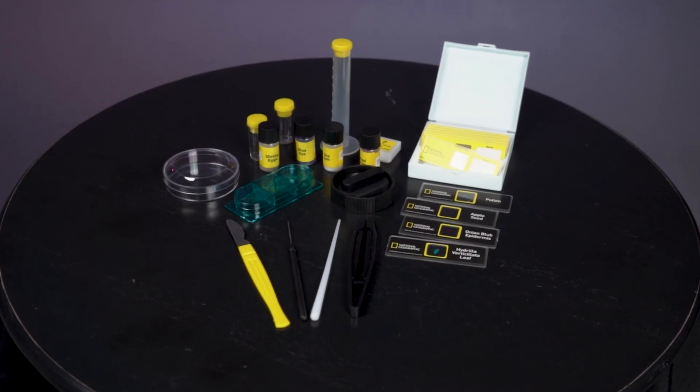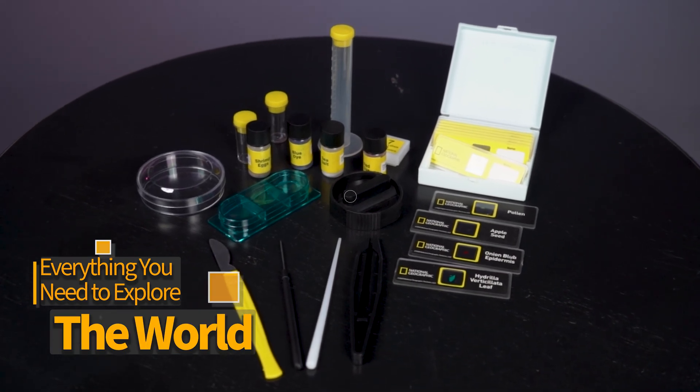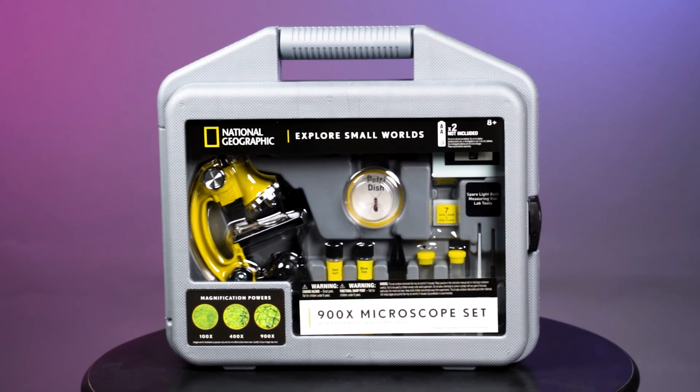The set also includes an experiment kit, instructions, and accessories, so you'll have everything you need to discover the hidden details of the world around you. The included carrying case will keep everything organized and ready to go wherever your curiosity takes you.